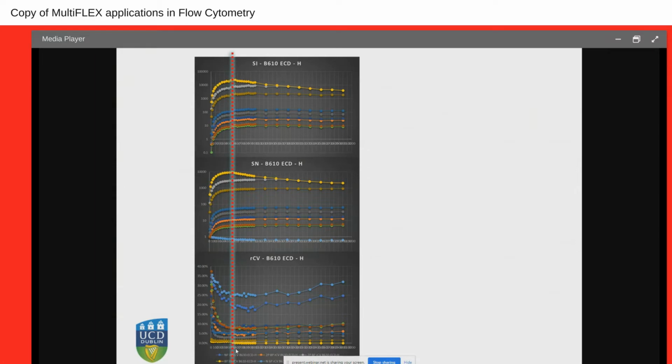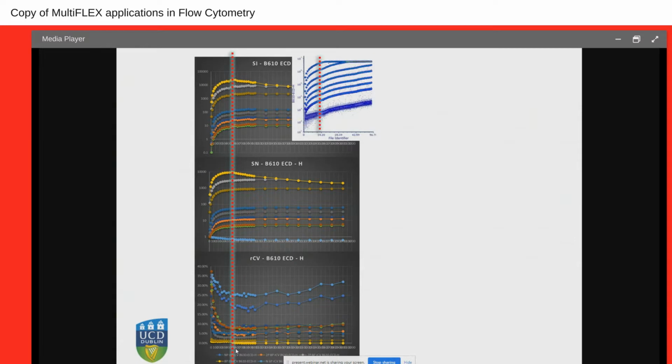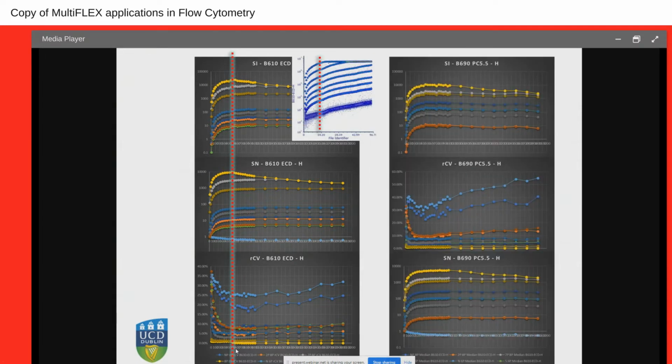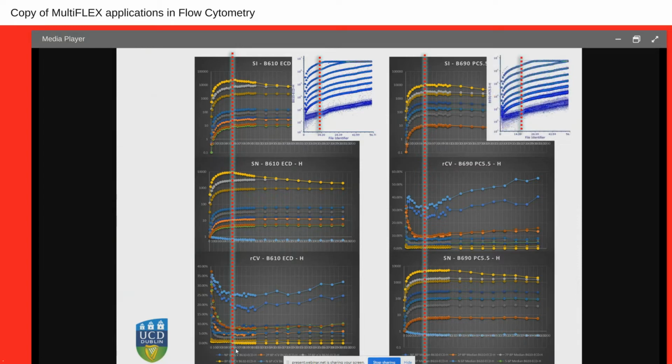A gain that gives us confidence that we'll get a good signal. And we'll do it for each one of the channels that we have on the instrument. That way, we'll get a minimum, a starting position, with the confidence that it's quite close to what we want to use for most of our samples.